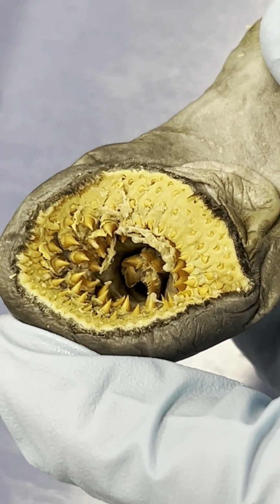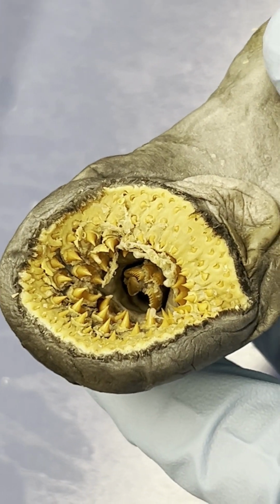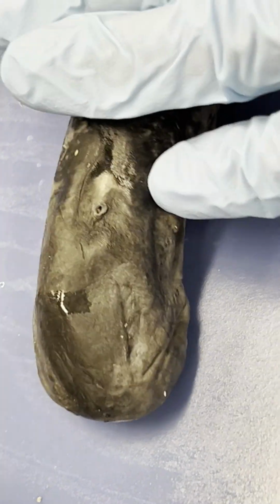Really cool looking animal, potentially scary looking animal. But again, we humans and all vertebrates that we're thinking of that are in existence today evolved from proto-vertebrates just like this lamprey.